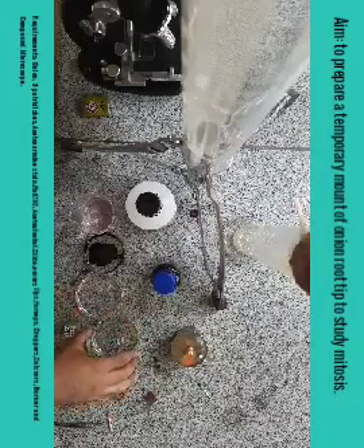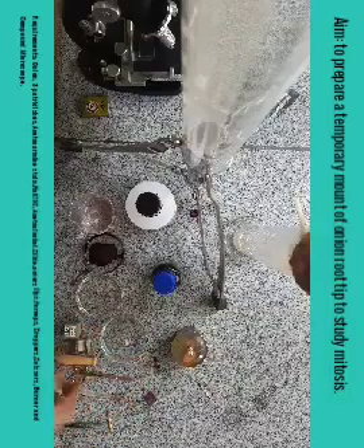Second, HCl — hydrochloric acid, one normal — and third, a fixative made by mixing a one-to-three ratio of acetic acid and ethanol. And coverslip, slides, droppers, scissors, and of course a microscope, under which we will observe the slide which we are going to prepare.